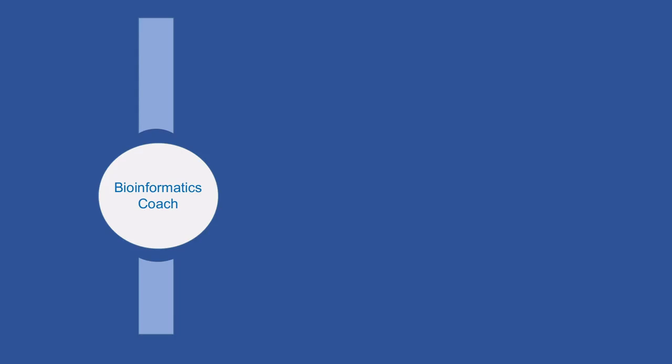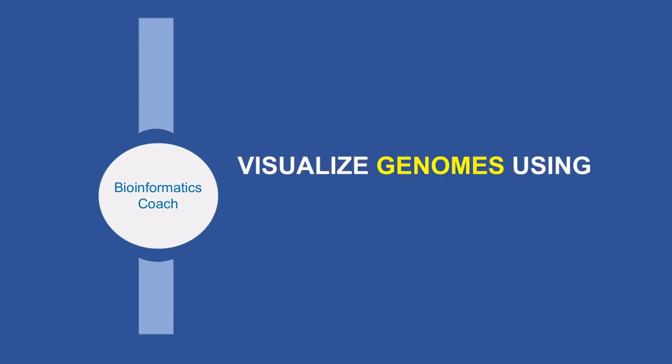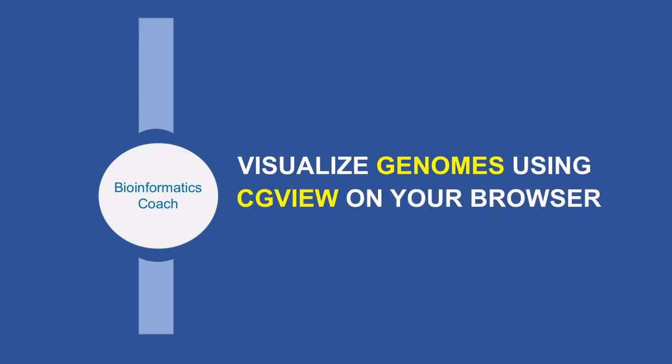Hello guys, this is the Bioinformatics Coach here and today I'm going to show you how to visualize genomes using the CGView tool. The only requirement for this tutorial is your internet browser.